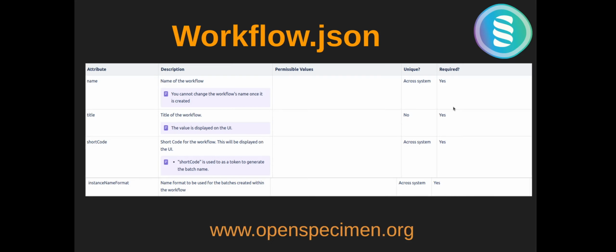So the JSON file has the name attribute, which will be unique across the system. This represents the unique identifier for the workflow, and as I said, it will be unique across the system. The second part is the title. The title of the workflow will be what is displayed on the UI. The next is the short code. The short code will later be used in creating the batch name using the instance name format.